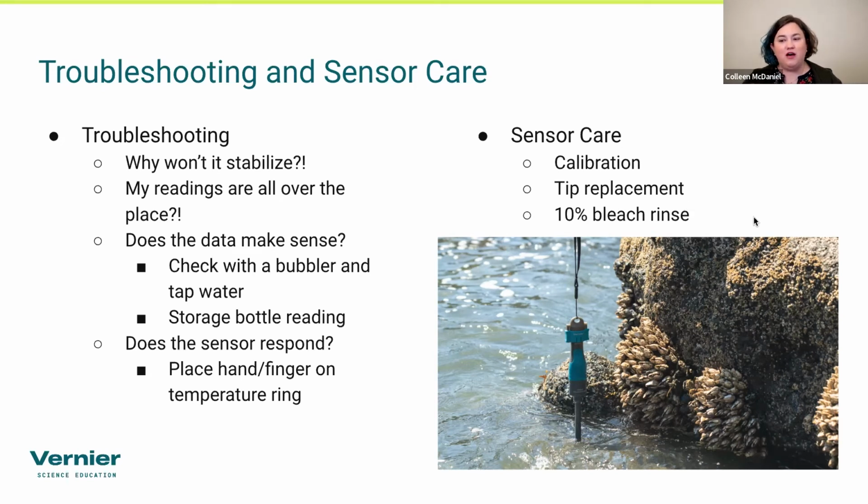And another question we often get is, how can I properly clean these? A lot of times I just rinse them with distilled water and they're good to go. If I'm doing data collection in a really mucky eutrophic pond with lots of algae, super stinky, probably tons of bacteria in it, when I get back to the lab or the classroom, I would do a 10% bleach rinse.